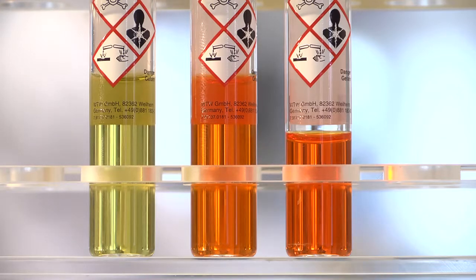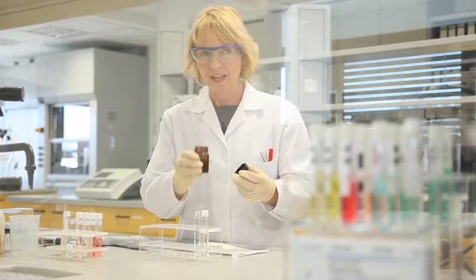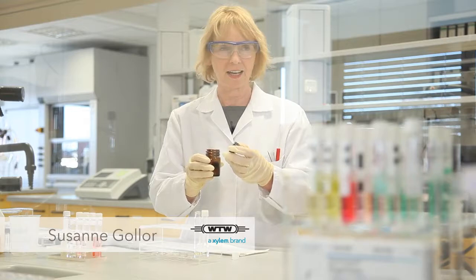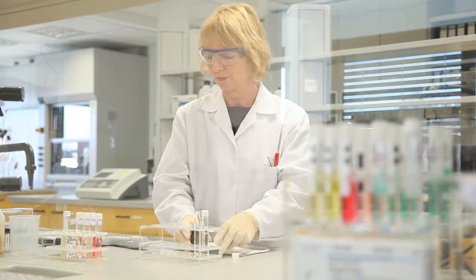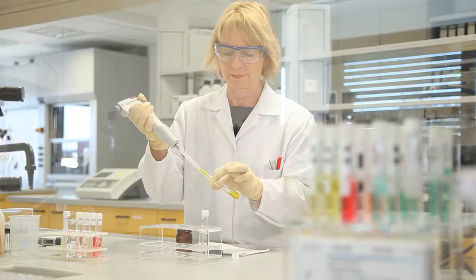Spectrophotometers offer many functions such as reaction kinetics and complex multi-step and multi-wavelength measurement procedures. Here we've got a sample and want to determine its spectral characteristics. We pipette some of the sample into an empty round cell.